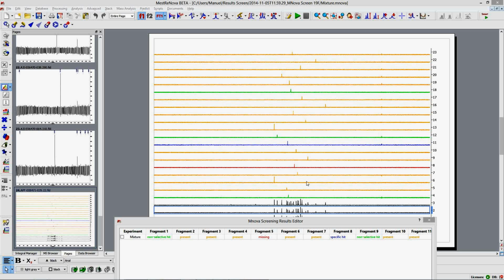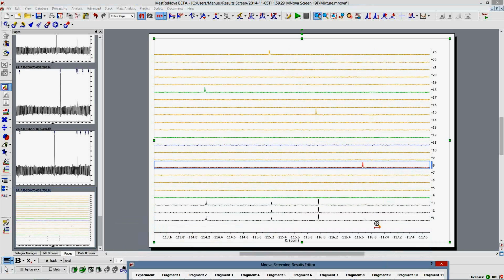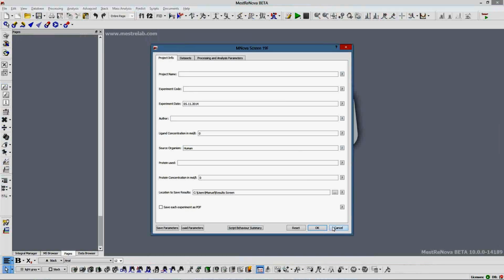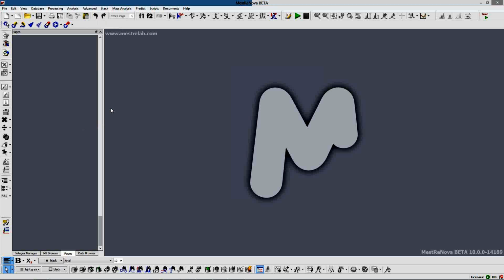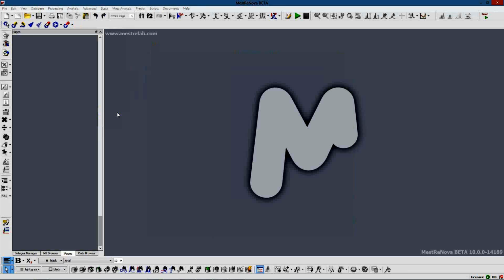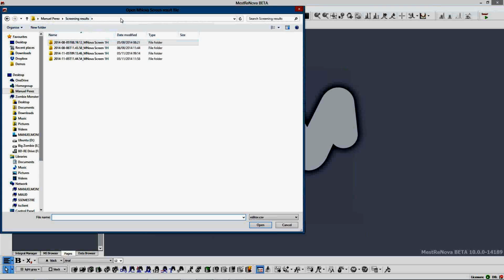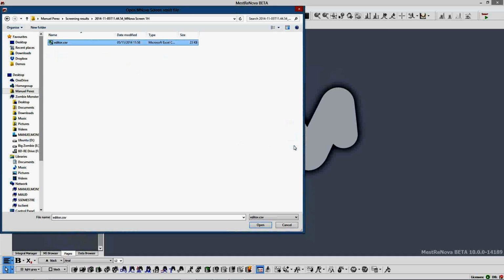And we can carry on and look at each one to see which one is missing. Obviously, for Fluorine it's kind of easier. So we can see in here that our one missing one. For the entire spectral width, for that particular case, that proton we were looking at would be the one that is actually missing.